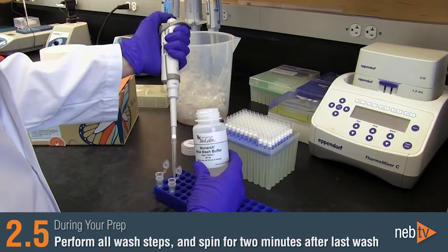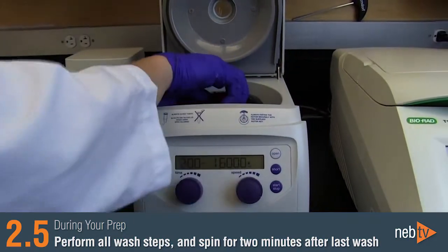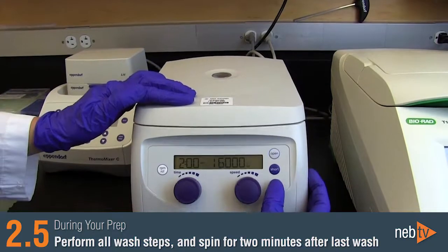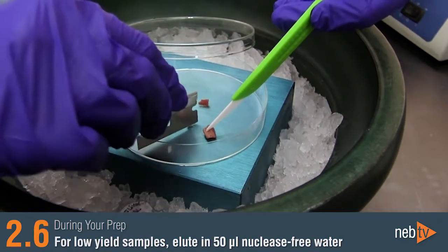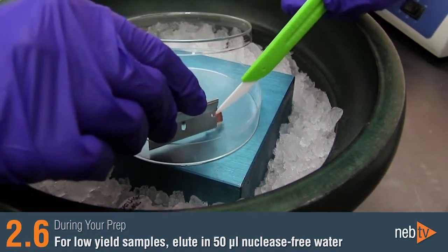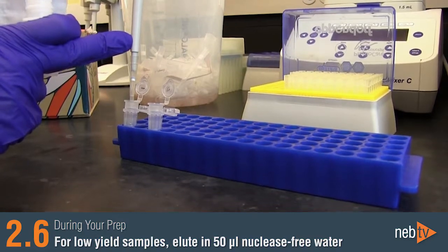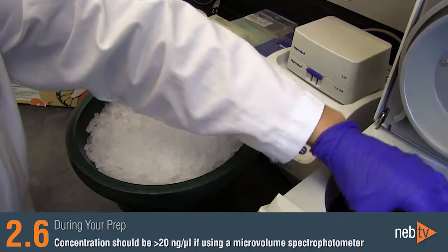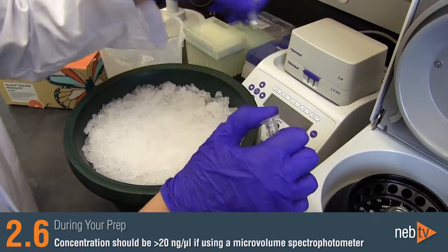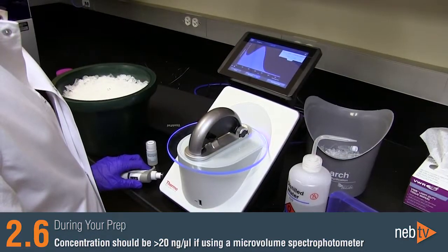It's very important to perform all wash steps in the protocol in order to produce highly pure RNA. Be sure to spin your column for two minutes after the last wash. For low-yield samples, including muscle or brain, or for low starting inputs, consider eluting the RNA with 50 microliters of nuclease-free water in order to get concentrated RNA. It's important to have a concentration above 20 nanograms per microliter if a microvolume spectrophotometer such as a NanoDrop will be used to measure concentration and purity.